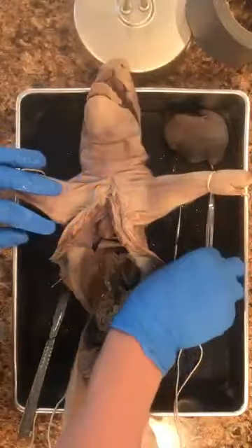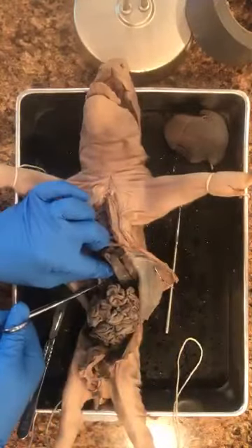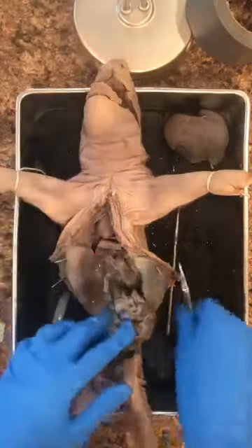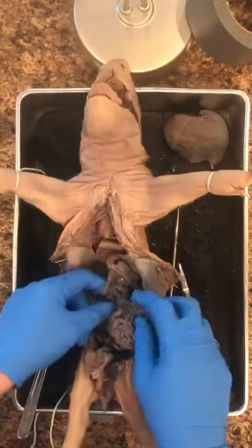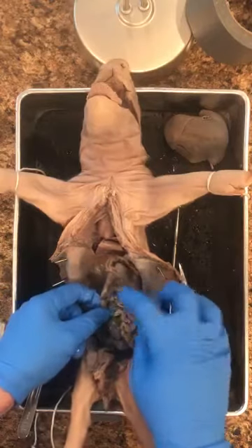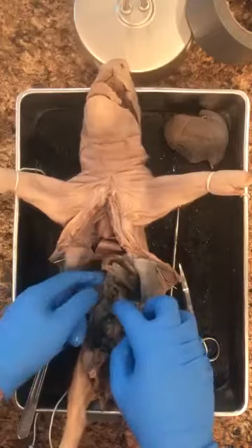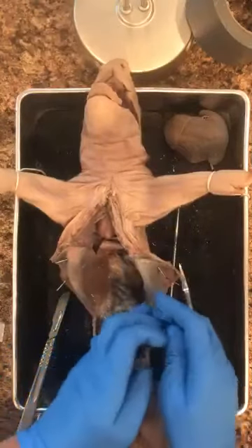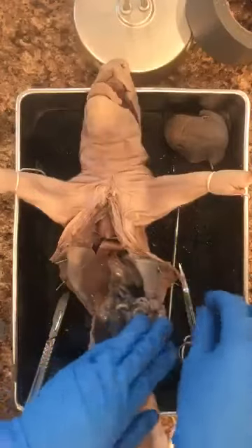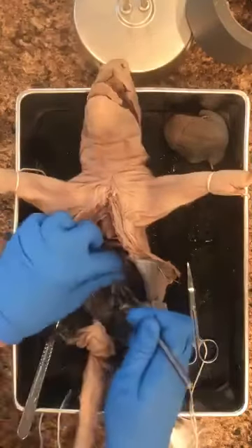I see the pancreas. I'm starting to cut part of it. I don't want that to happen. Okay guys, just because I can see it really well right now and I don't want to end up cutting it, this is the pancreas. I'll talk about that more momentarily, but it has this weird texture.